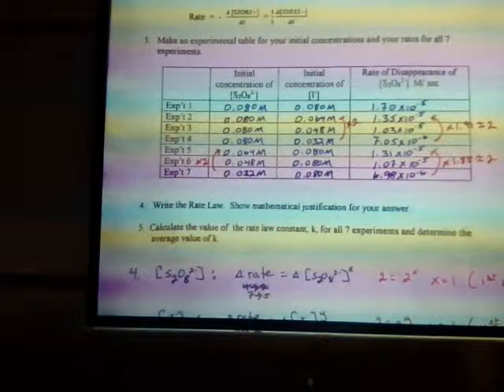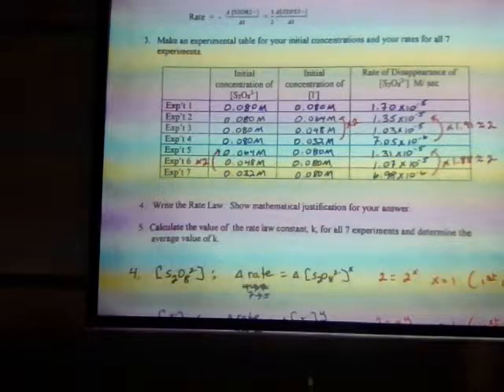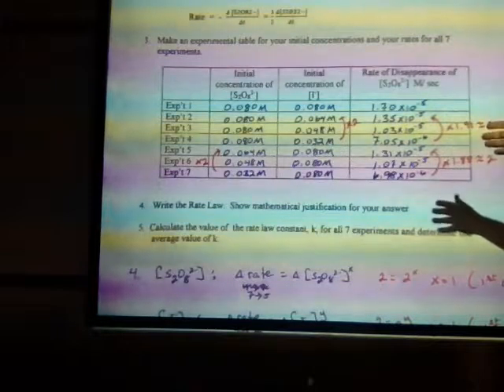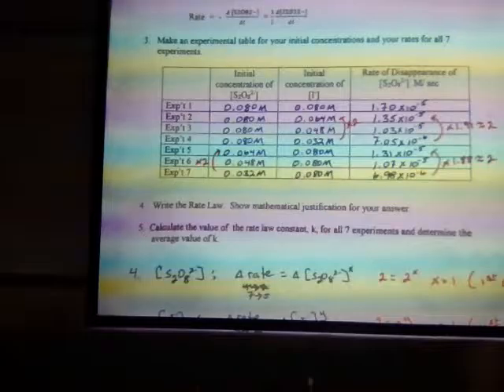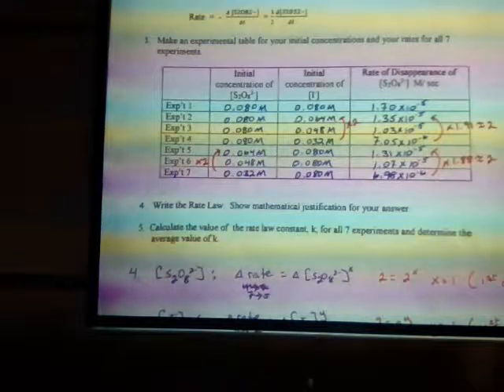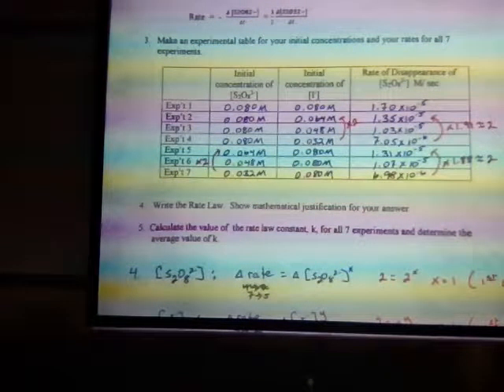But what's more volume going to do? Dilute it some more. So it may make the concentration not be consistent every time if you use too many drops. Okay? And the other thing is some of y'all waited until maybe after you swirled it to start. Some of you maybe as soon as it hit, you hit start.